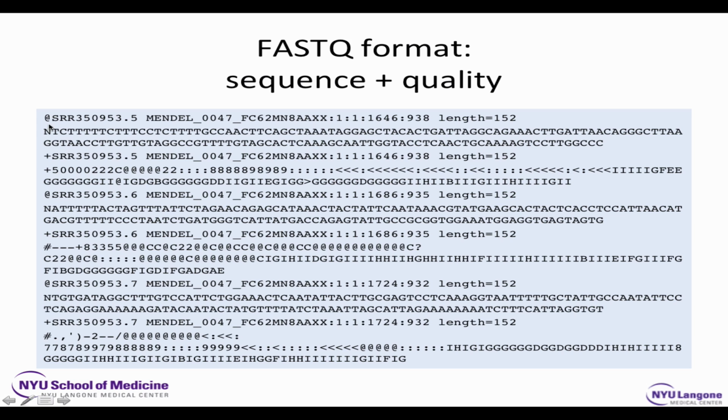The first line is a header line. We sometimes call that the metadata. It looks very much the same for each read because the first little bit is the name of the sequencer, and then there's a code for the plate that you've loaded onto the machine, and then there's a code for the actual position on the plate of this little spot that's generating the fluorescent signal that led to this sequence.